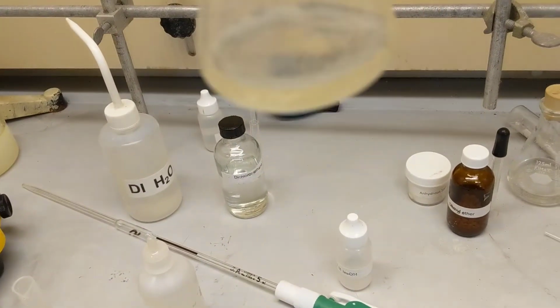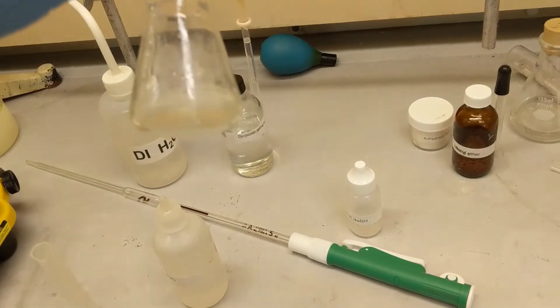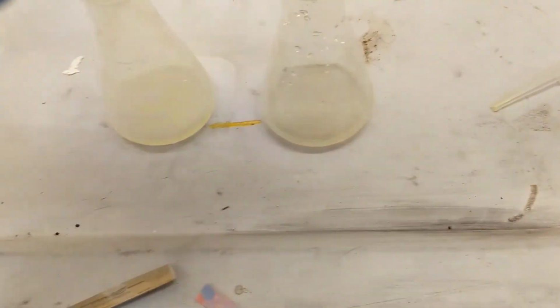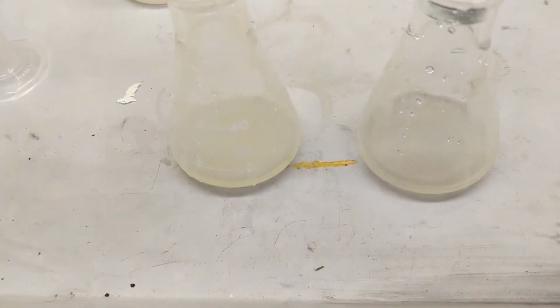Acidic, as you can see. But you see there's less condensation. Let me zoom in. Yep. Less condensation in this one compared to this one. Less condensation in the second extraction than the first. And you guys can work out why that is.